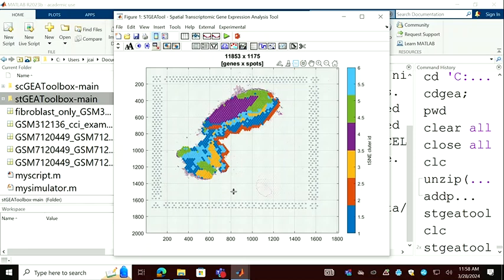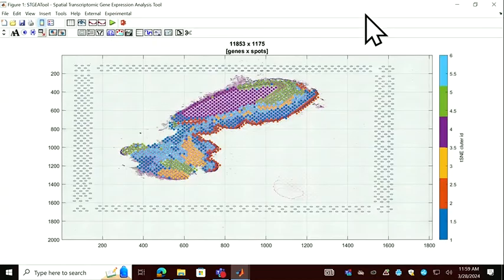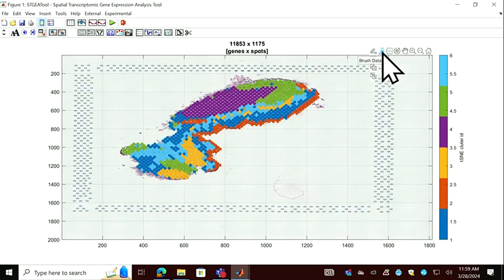Oh, that makes sense. So then using the lasso, you select the cells in the same clusters. Yeah, if you really want to select those by hand, you should be able to brush the spots, then click the shift, brush another spot. So in this way, you can select, but it's difficult. For example, I'm selecting those cells, but they are in different locations to make one cluster. It's possible.